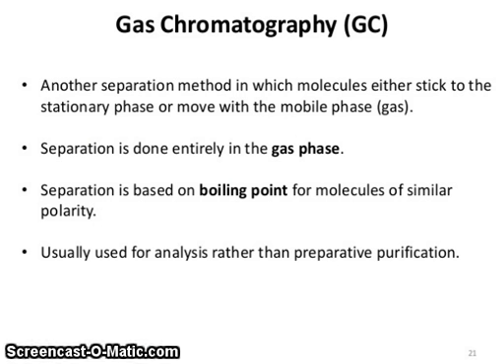Now gas chromatography, another separation method in which molecules either stick to the stationary phase or move with the mobile phase, gas. Separation is done entirely in the gas phase. Separation is based on boiling point for molecules of similar polarity, usually used for analysis rather than preparative purification.